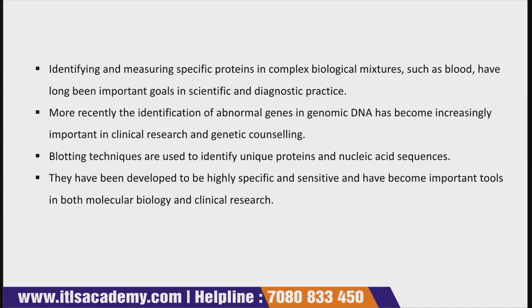So it has great application and importance in clinical research and genetic counseling, because it is used to identify the abnormal genes present in the genomic DNA.